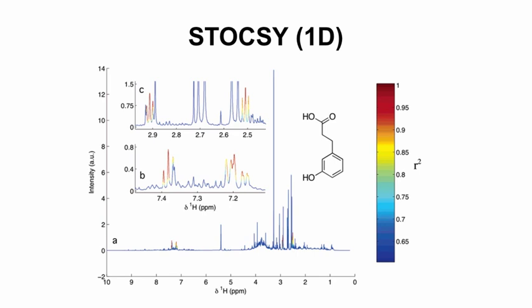And by looking at the spectra carefully, in this case, they actually isolated the compound. They were able to identify it as a sort of phenolic acid, in the compounds depicted there. So potentially you could have identified this using TOCSY or through standard isolation methods. But this essentially was identified as being, A, an important metabolite because it varied a lot, and B, using the chemical shifts and their covariance, you're able to identify that this belonged to the same molecule and was sufficient to start identifying a probable likelihood. A, it's an aromatic molecule, slightly asymmetric, and B, that there's probably some aliphatic portion in this compound.